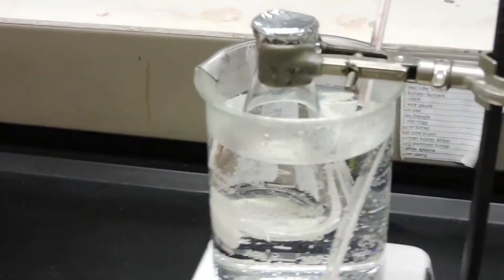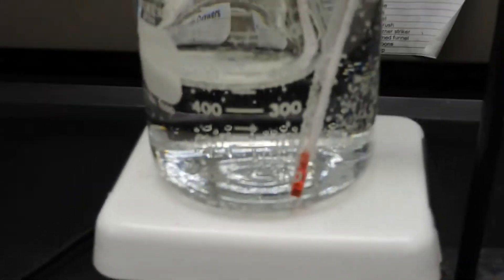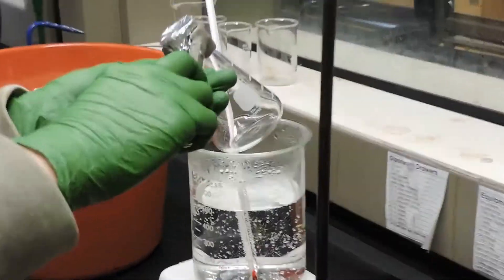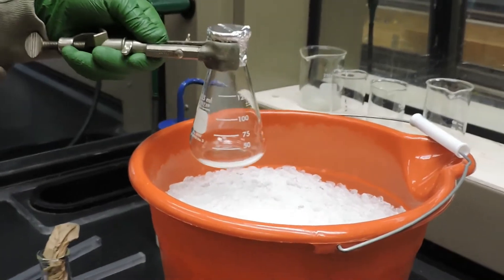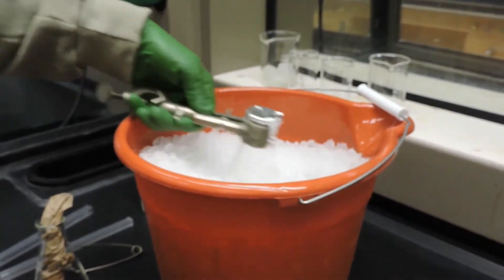Now that we have the Erlenmeyer flask with the unknown liquid clamped into the hot water bath, we will continue heating at the boiling point of water until the liquid has vaporized. Upon analysis, you can see that the unknown liquid inside the flask has evaporated. Now we're going to take this and place it in the ice bath to cool it down and recondense the vapor in the flask.